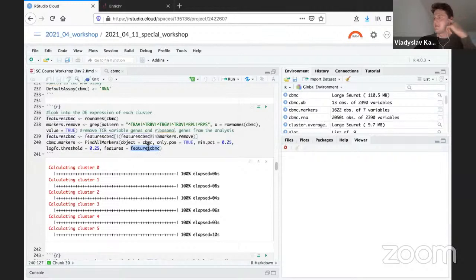Yeah, what I mean is, do I have to put that into the Seurat object? Well, sorry, what did you say? Do I have to put that information, that database, in the Seurat object? Yeah, you need to download it and then load it into R, and then you can use it in R for the find markers function. Sorry, I didn't hear you. That's really very hard to hear. When you say R, you are talking about the Seurat object that we are working on. Yeah, probably in RStudio or any other environment that you're using.